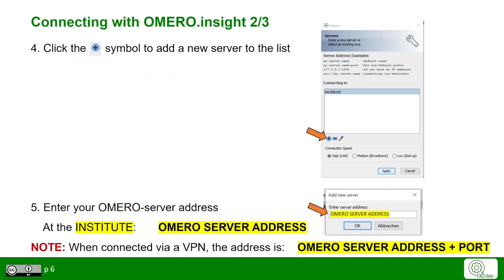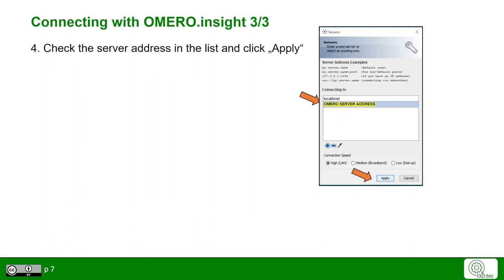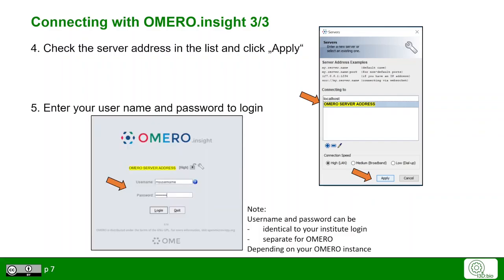Here you have to add the Omero server address at your institute. Please note that in some cases it might be required that you also have the port at the end of the server address. This could be true if you connect to Omero with a virtual private network. Choose the right Omero address from your server list and then click apply. Now you can use your login credentials to access Omero.